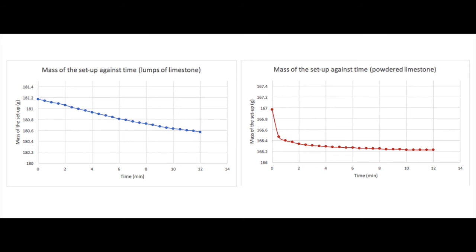This is the end of the experiment, and this is also the end of the video.